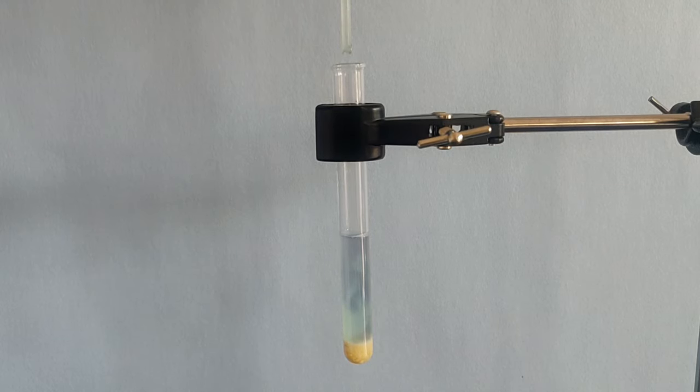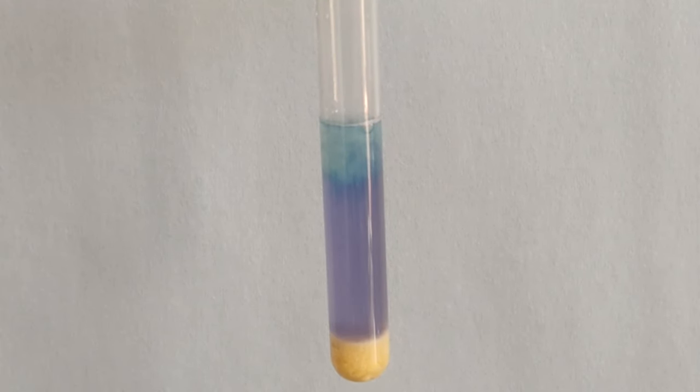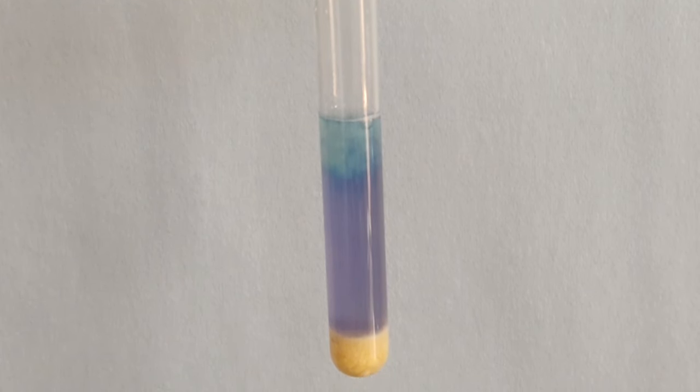You will notice the contents of the test tube are turning purple. This indicates that there is indeed protein content present in dal.